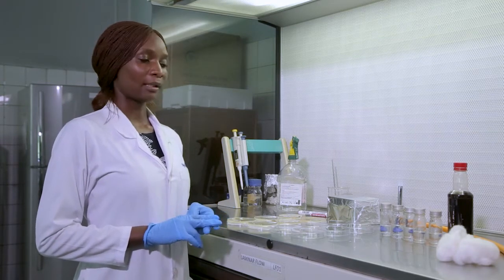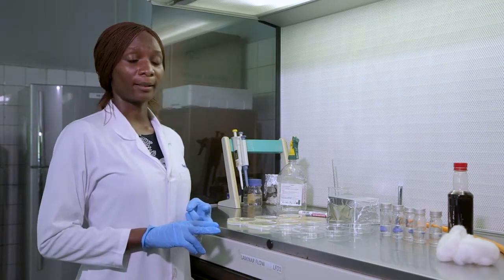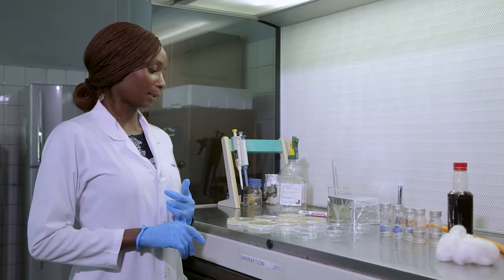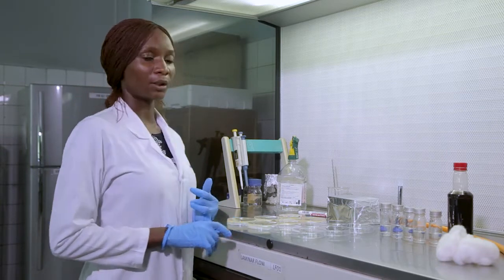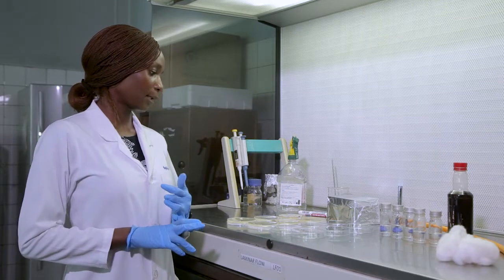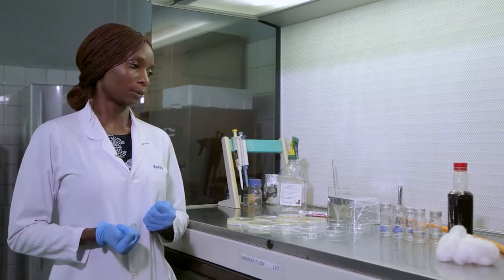We're going to do two tests, that is the total plate count, where we shall use plate count agar, and the other technique is the surface plating or surface spreading technique, where we're going to use potato dextrose agar acidified with 1% lactic acid, and we shall be enumerating or looking out for yeasts and molds.